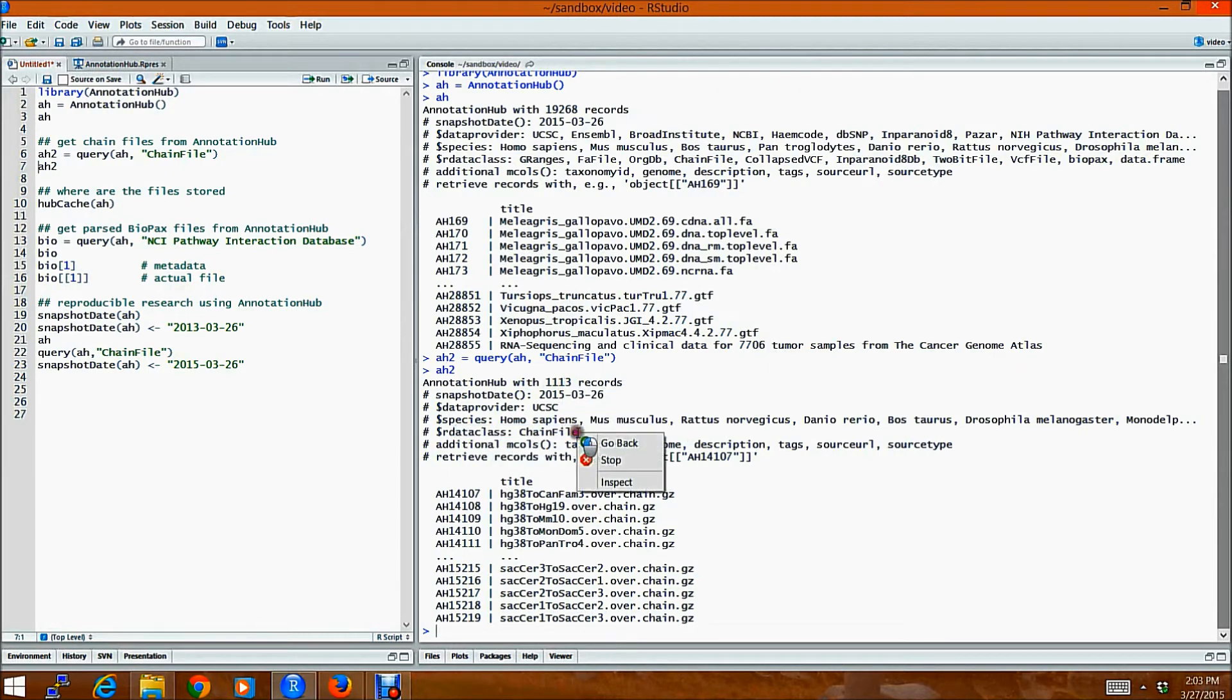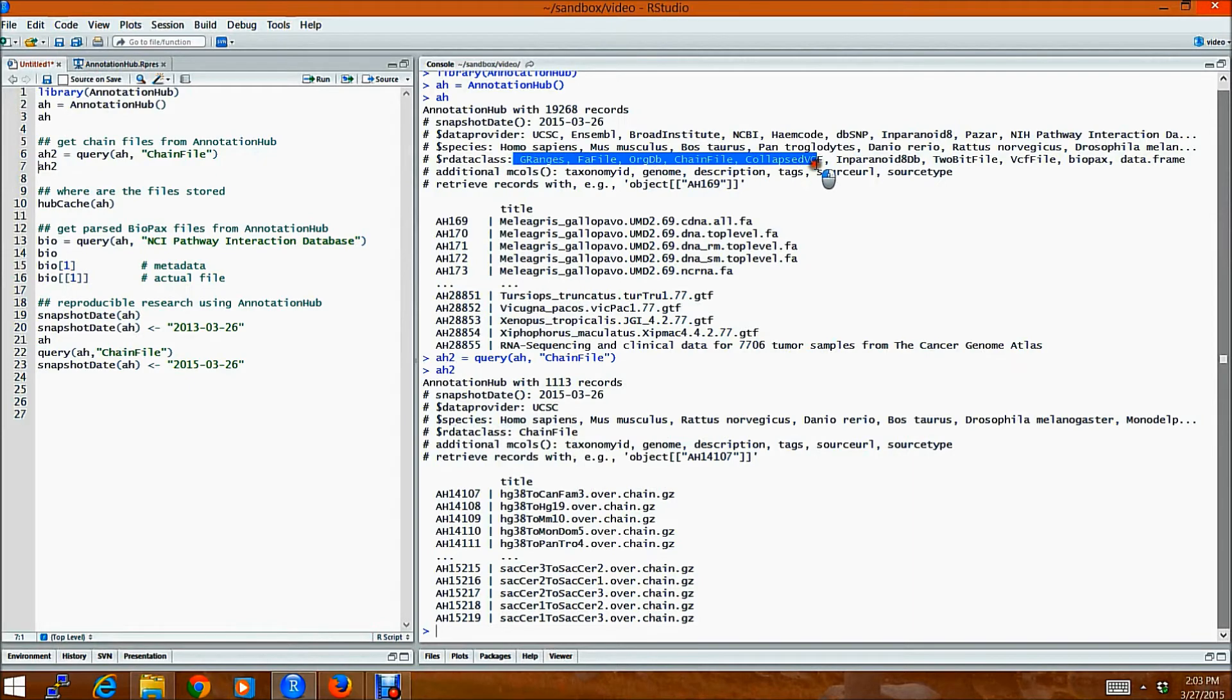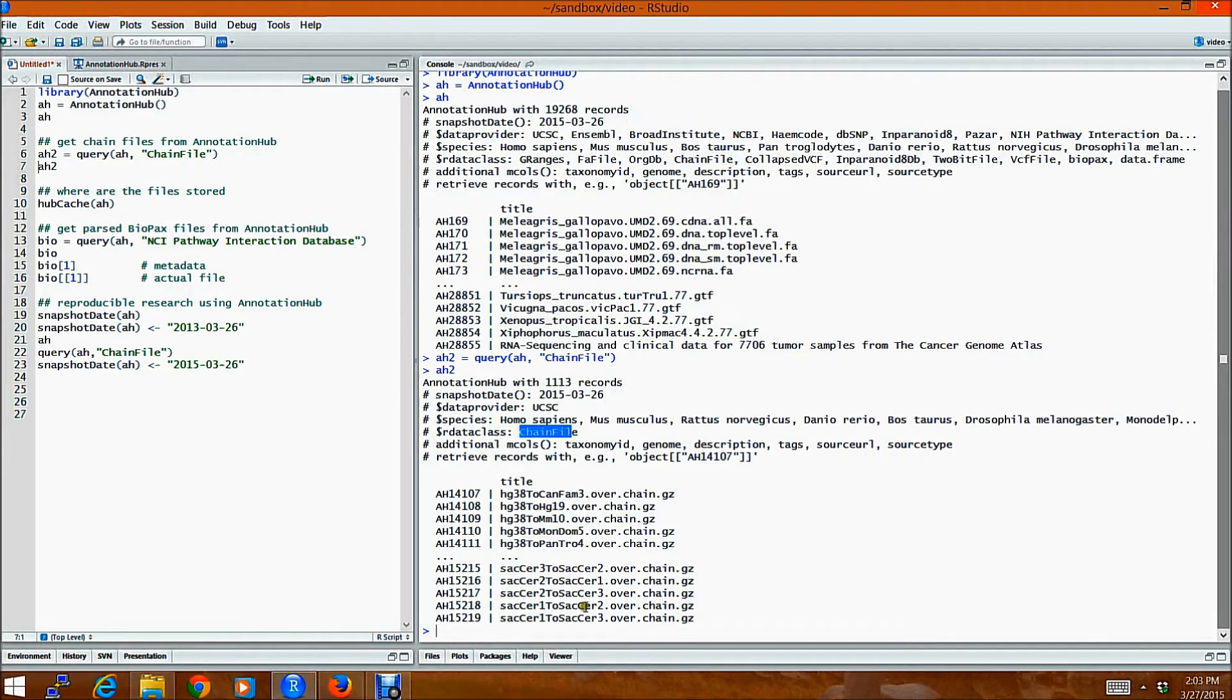I will see that the AnnotationHub resource has been subset to about 1100 records which contain only chain files. You can see that the R data class right from here which contained everything has just been reduced to chain files. And these are the possible chain files that you can look at.